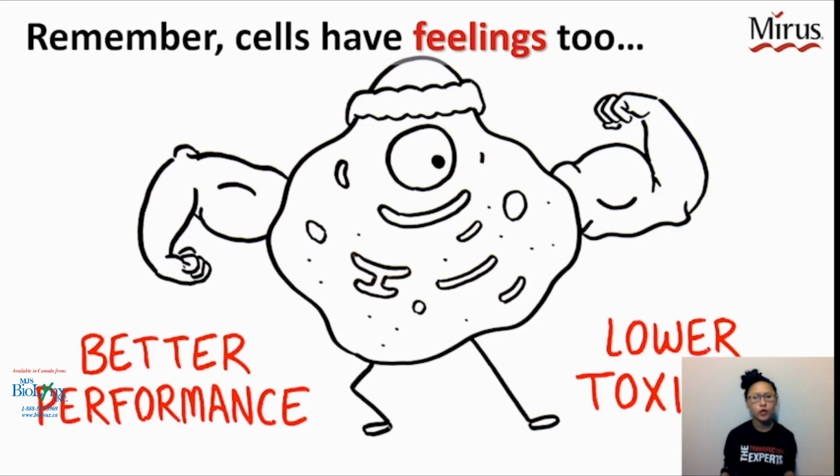All right, so we're getting to the end of our time here together, and I just want you to remember, cells have feelings too. Just look at that guy. Each experimental system is unique, and when your transfection isn't working, or if you're just starting out, you might want to adjust some of the parameters that we discussed today.